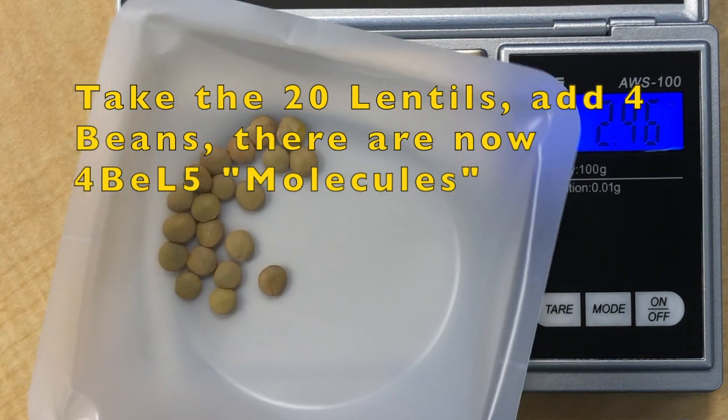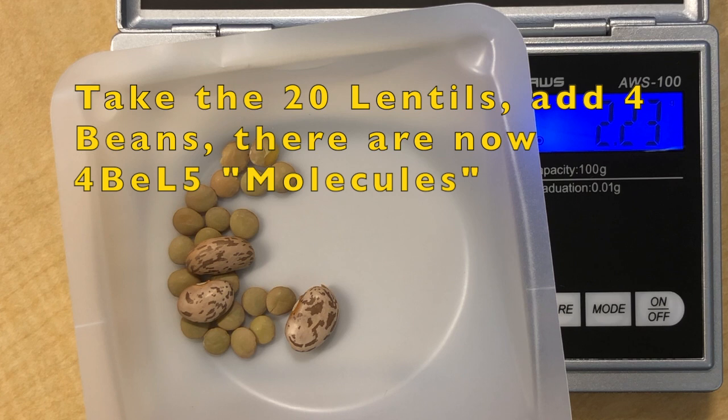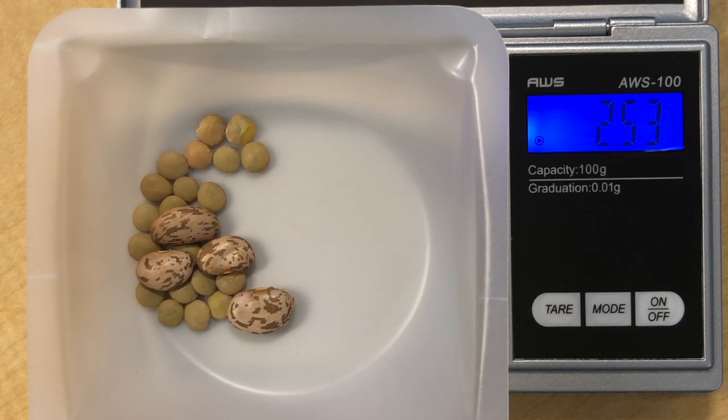Now you have an average mass for one lentil and one soy bean. Since there are 20 of each and we want to build LS5 molecules, 20 divided by 5 is 4, so you need 4 of each type per group. The mass of the LS5 assembly is 2.53 grams, and dividing by 4 gives 0.6325 grams per LS5 molecule.